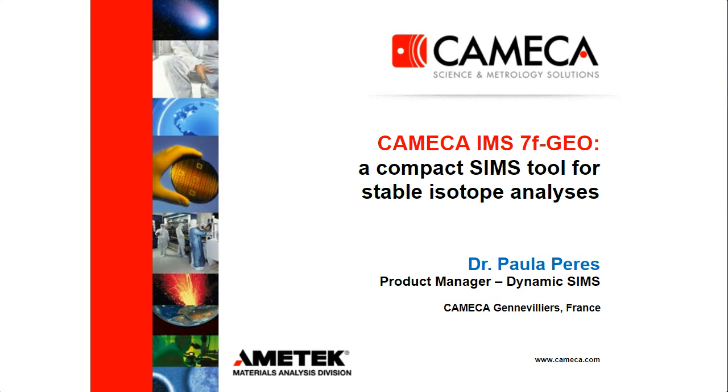CAMECA is, as you know, a manufacturer of magnetic sector mass spectrometers. This talk will show applications of the CAMECA IMS 7f-GEO to stable isotope analysis.